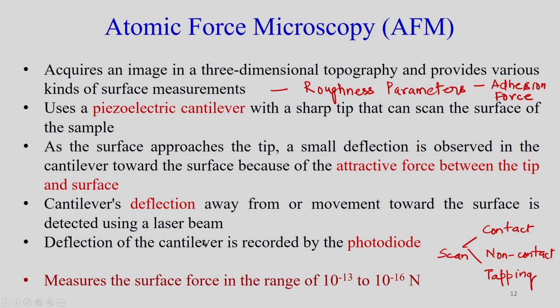So, if you remember module 1, when we discussed what should be the minimum force one can measure using atomic force microscopy, or particularly using these van der Waals forces. So, it measures in the range of pico Newton, 10 to the power minus 13 to 10 to the power minus 16 Newton.